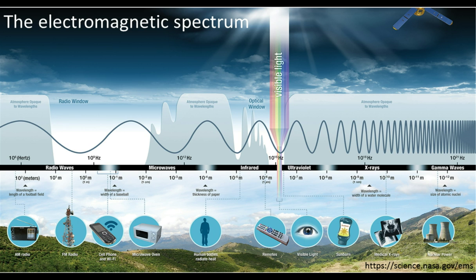In the visible and UV, that's mainly atomic electronic transitions in atoms we observe in the outer shell of atoms, and moving to even higher energies, X-rays are produced by electronic transitions in the lower atomic shells, and in atomic nuclei, observations are done in the gamma range of the electromagnetic spectrum. So it's a really wide range that is covered with applications.